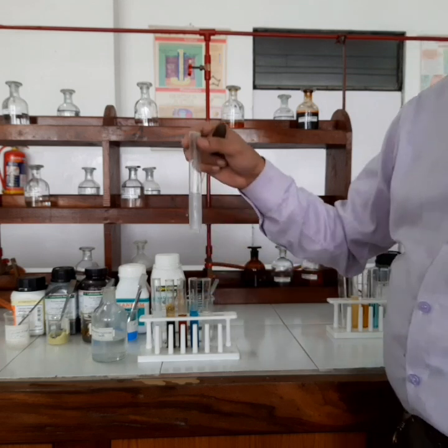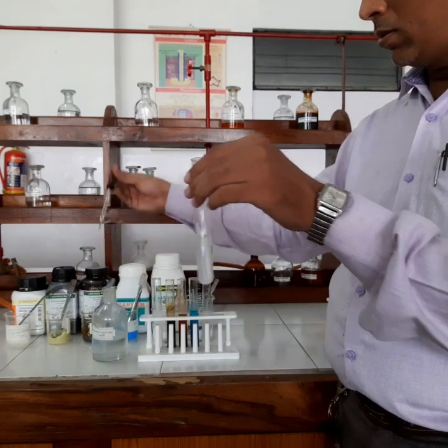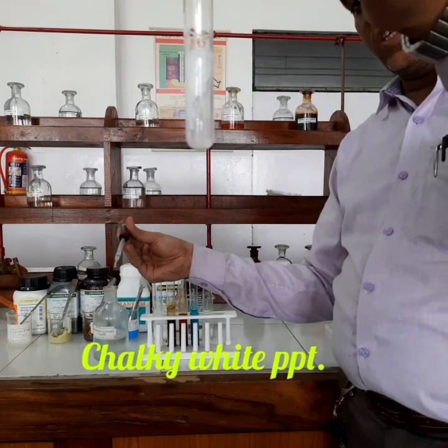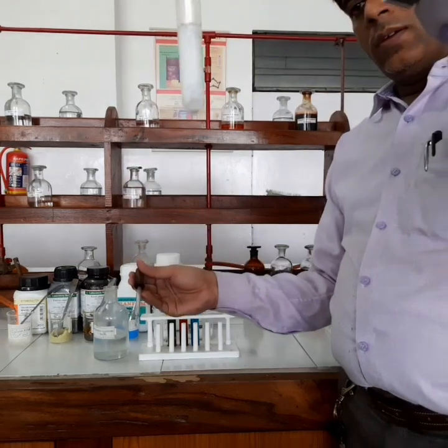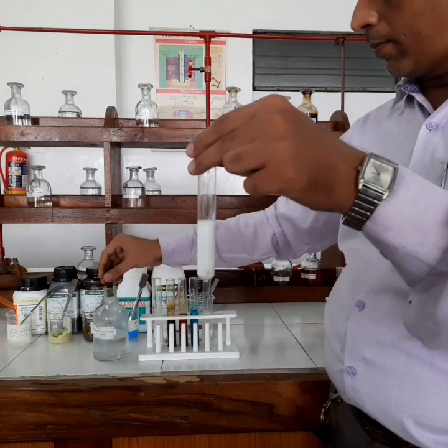The last one is that of lead. I have taken a salt of lead nitrate, and I am going to test for lead ions. On adding in limited quantity, as you can see, a chalky white precipitate of lead hydroxide is forming. Now if I add NaOH in excess, what happens? Let's see.